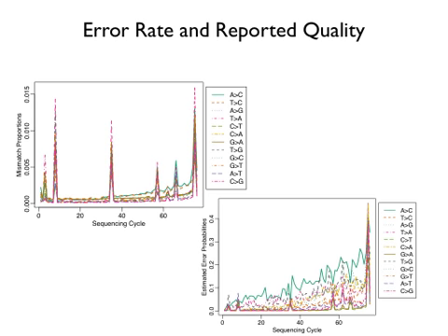The peaks are just one cycle? Yeah, so that's at one cycle. That's at cycle looks like 9 or something like that. This isn't that common to see something this bad. So this is a quality plot that we like making.